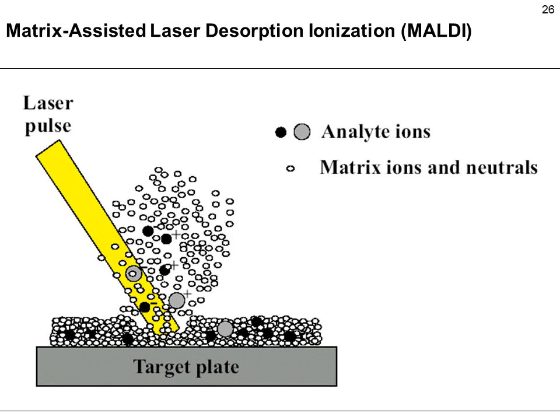Looking at a schematic of MALDI, we see that on the target plate, so this is one of these round things that we saw before, we see the matrix, so a lot of matrix, and a few analyte molecules embedded in the matrix. You can imagine as the laser pulse hits, a lot of energy is transferred to the matrix.